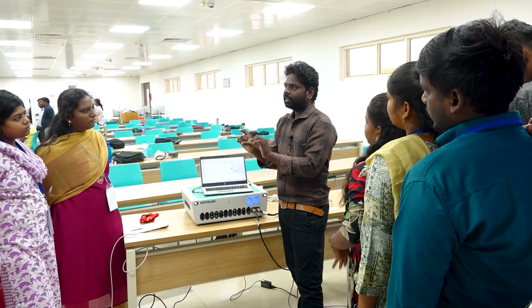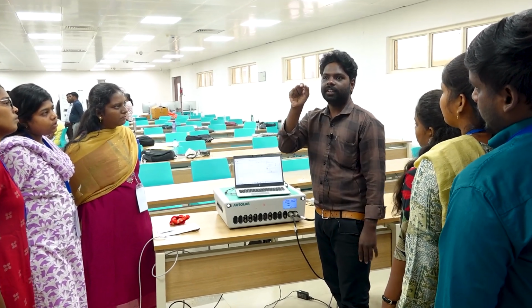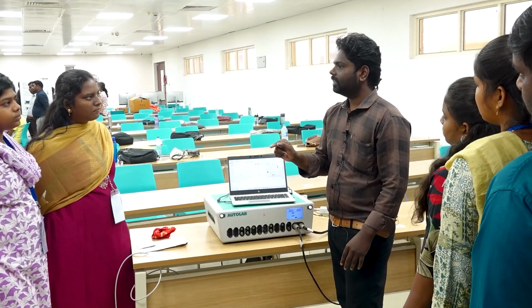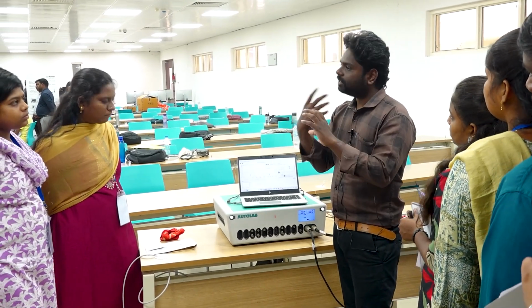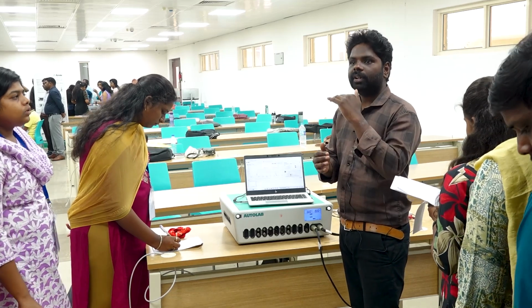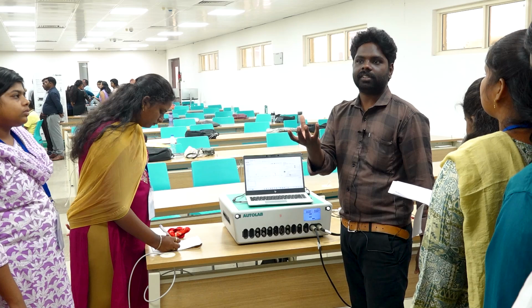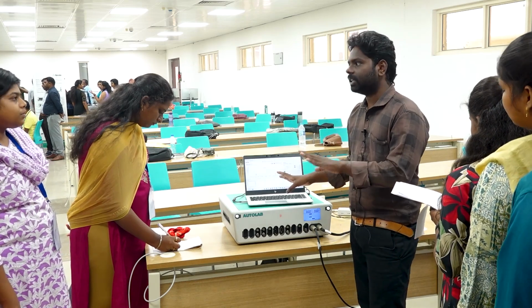But the charge transfer resistance denotes exactly your sample resistance. There we are giving some input, it gets disturbed, and it will try to limit and oppose our input. At that time resistance is created. That is called charge transfer resistance.